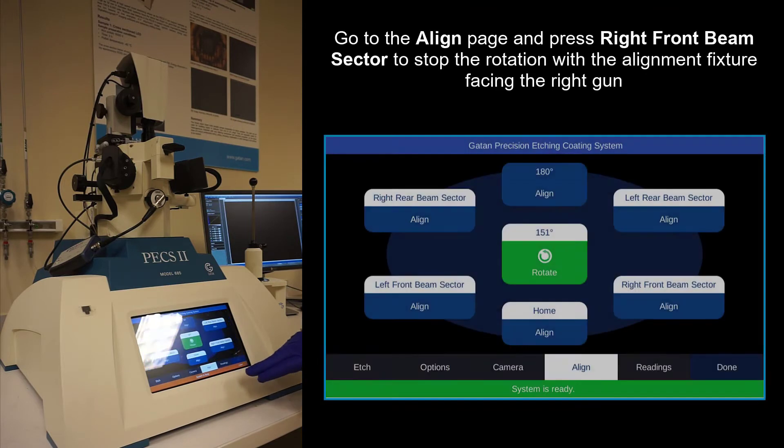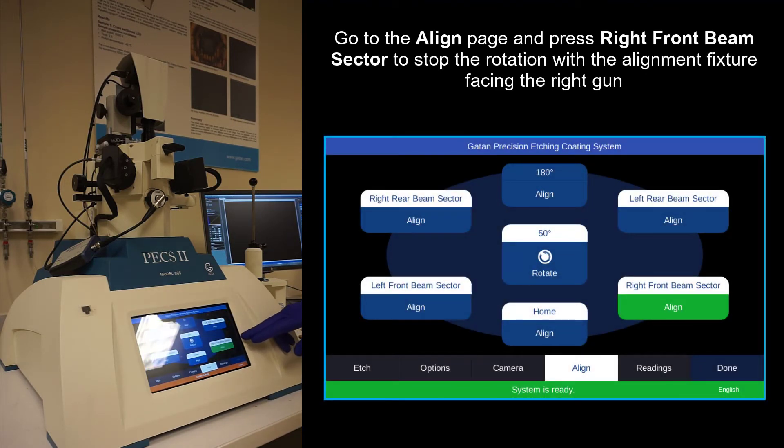Now go through the align page and go to the right front beam sector. And then this will rotate the stage so that it is perpendicular to the right gun. And now we will be able to see the surface there, align the right gun.